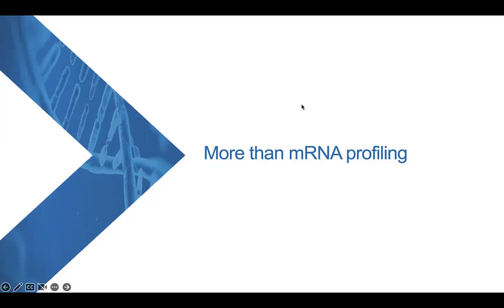Our chip enables you to prepare NGS libraries, or is the first step before the preparation of the NGS libraries, but you would still need to sequence those libraries on the Illumina instruments. So yes, there is a difference between our chips and the flow cell.